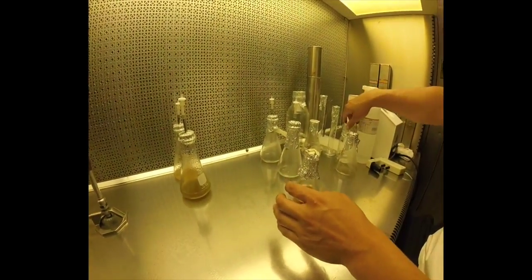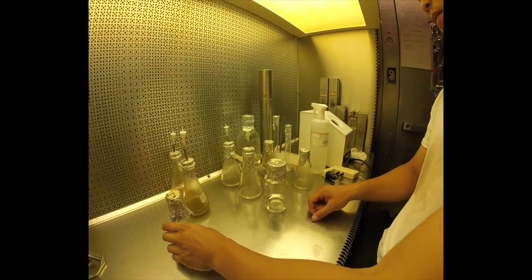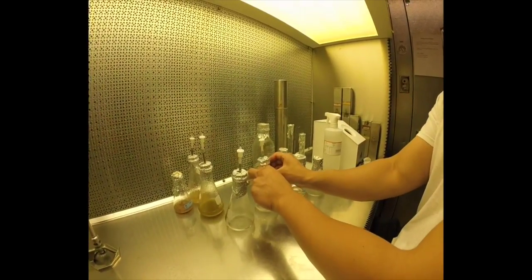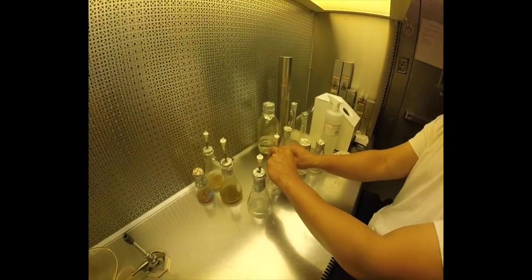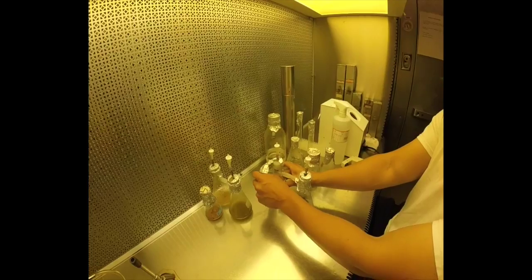So first, what we're going to do is transfer half X WFAM, 1/8 ammonium, as well as some B5 into the empty vacuum flask. And so here we can use some of the aseptic techniques. And again, note that the air is actually coming towards you from the back. So anything that you have above an open container that is behind it is a potential source of contamination.